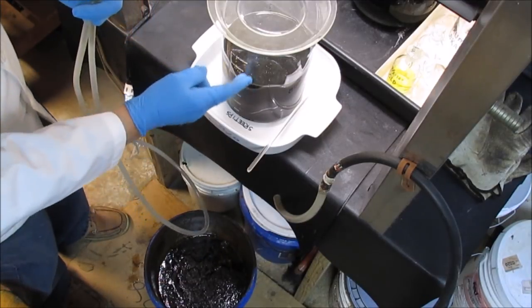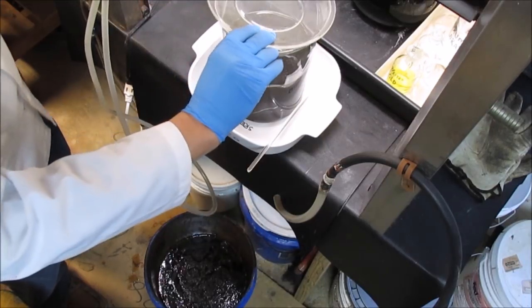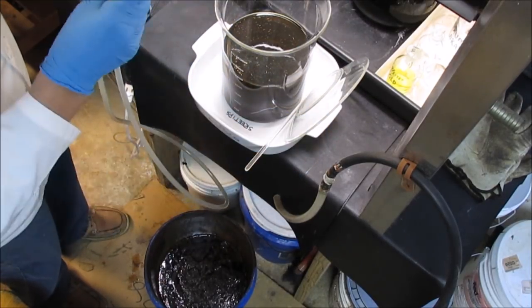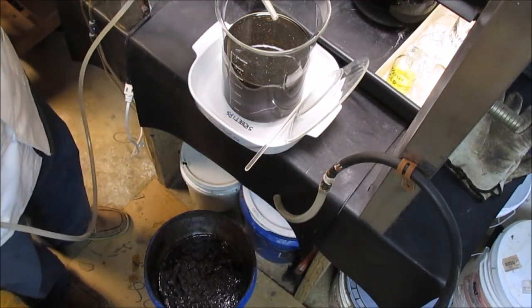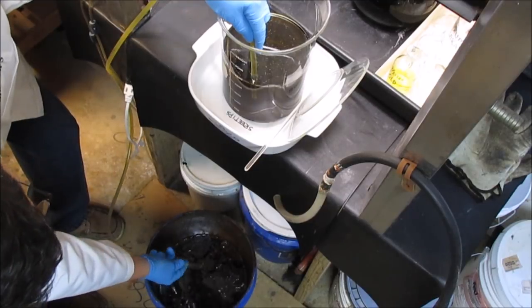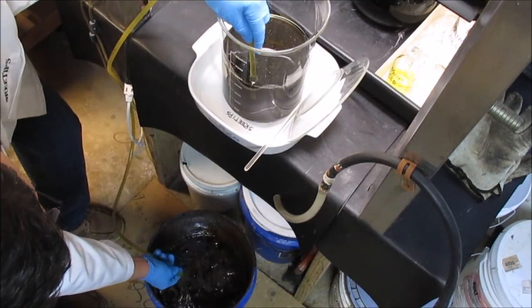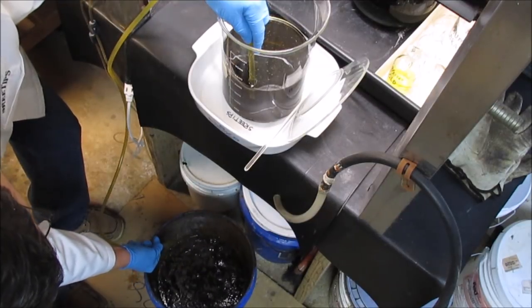I've already checked the solution with stannous. What I have here is a tube full of water. What I'm going to do is stick my thumb over one end like this, put the open end down into the gold waste solution, and just let my thumb off. I'm siphoning this directly into a waste bucket here because I know there's nothing else in there except waste.